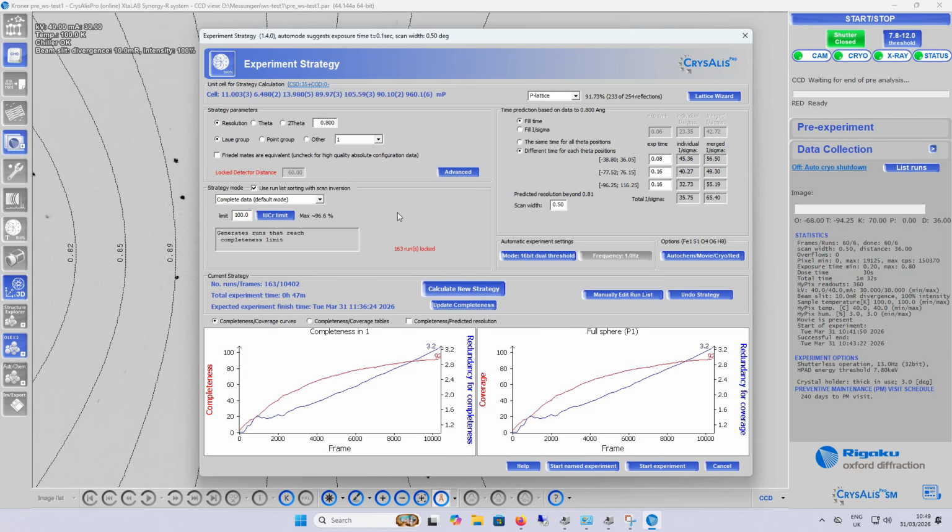Okay, so we could essentially run it like this, and just remember that, for example, after this, I don't remember what was there, 50 runs or something. After these 50 runs, if we are happy with the data, we could stop it and be happy.